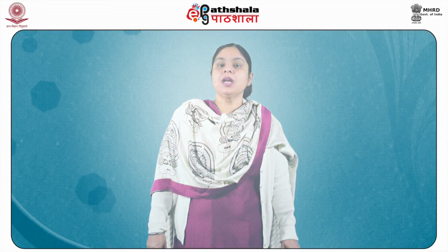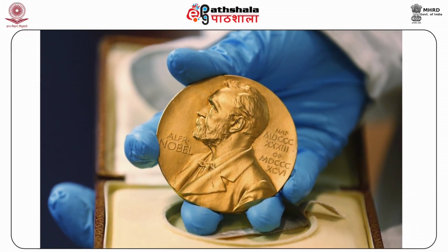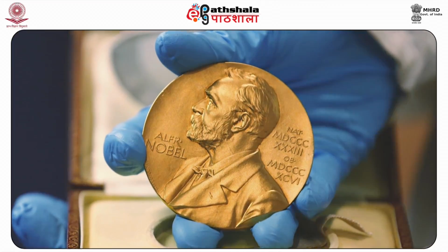Now the use of infrared spectroscopy to determine the molecular structure had its roots established in the 19th century, once the infrared region of the electromagnetic spectrum had been discovered by Sir William Herschel in 1800, while the Raman effect was discovered by C.V. Raman in 1928 only, which resulted in the Nobel Prize in 1930.